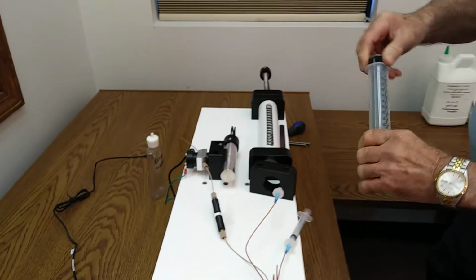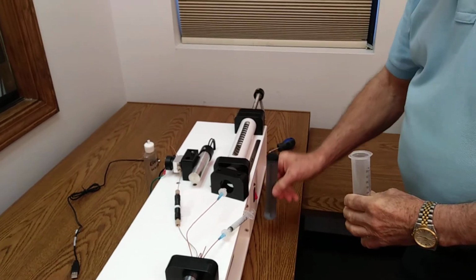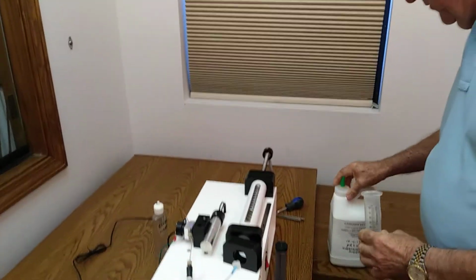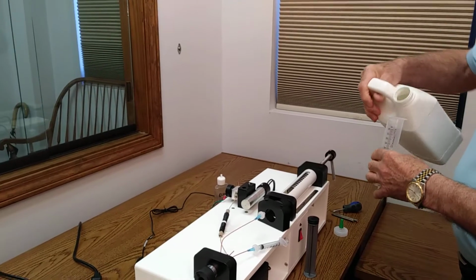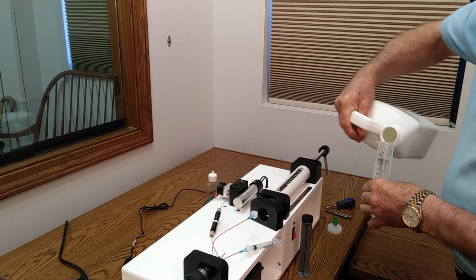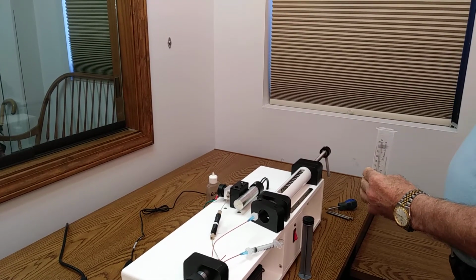I'm going to pull the plunger out of the syringe gently. Put it here, I set it like that to keep any dirt from the table from getting into the syringe. I'm going to fill it with what we call eluent. And if you get between 50 and 55 milliliters, it's fairly easy to work with. If you put too much, it's a little bit more challenging to put the syringe back in.